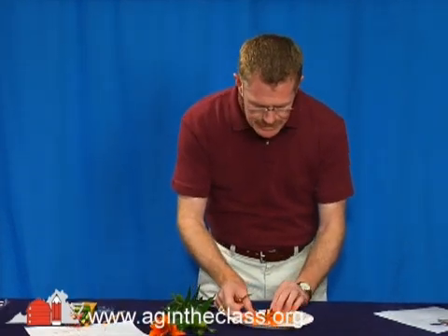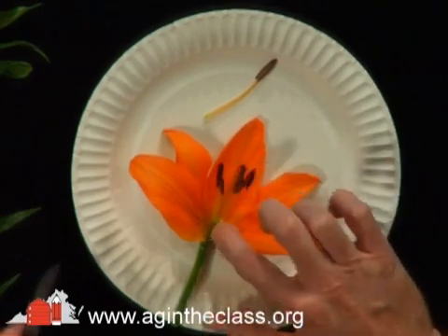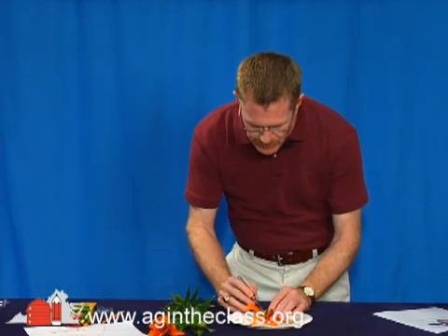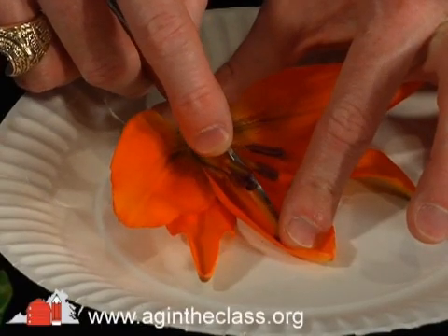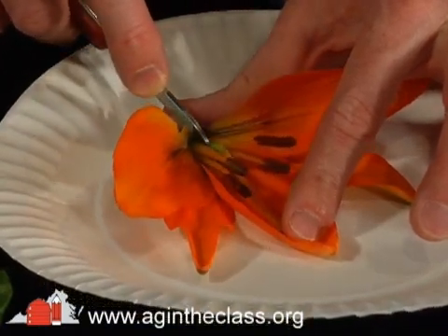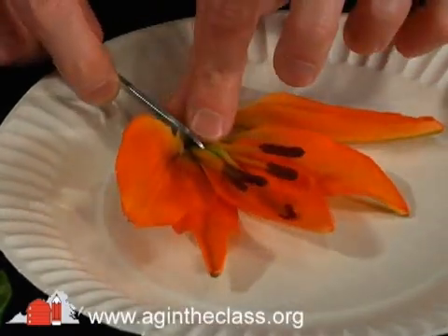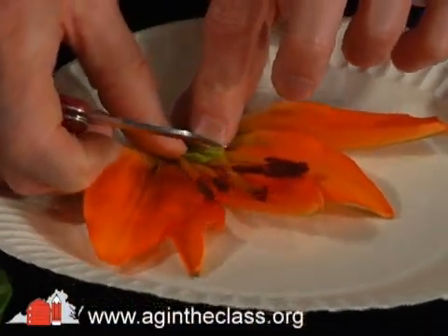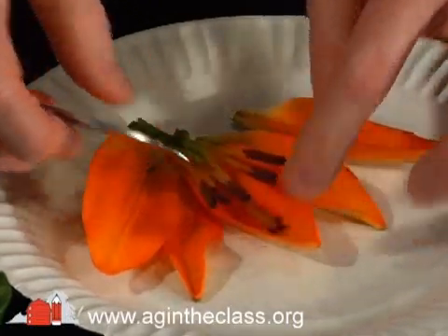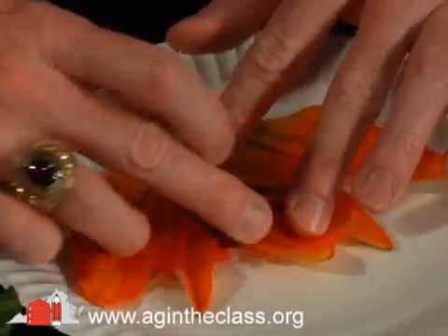Now that the stamen is removed, I can see down in there and I can see the entire pistil, which includes the stigma, the style, and the ovary there at the bottom. I'm going to spread my petals apart and take my knife in here and gently cut into the pistil, splitting the ovary at the bottom. It may work well if you're working with a partner to have them help hold the parts down, and just take your knife and run it right down that pistil — cutting into the stigma, the style, and then into the ovary.